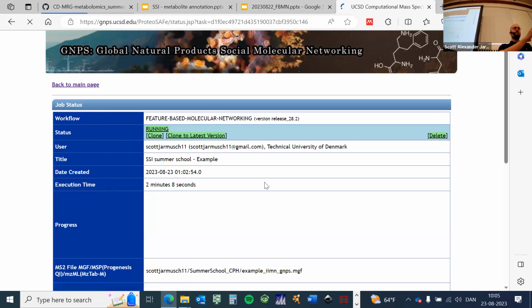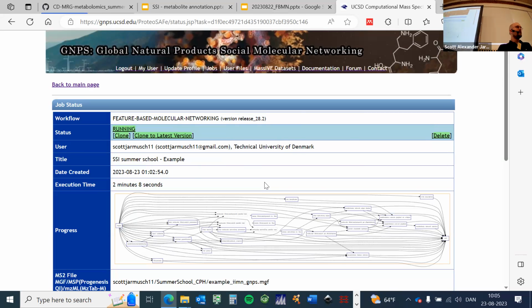What does that do if you don't actually need it? Nothing. It's essentially superfluous, I think. Uploading the MZML file with the MGF file is essentially a backup file to some degree. You can add it into MassIVE much more easily that way.